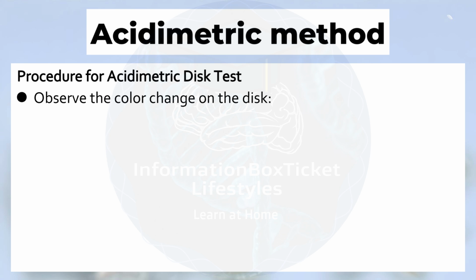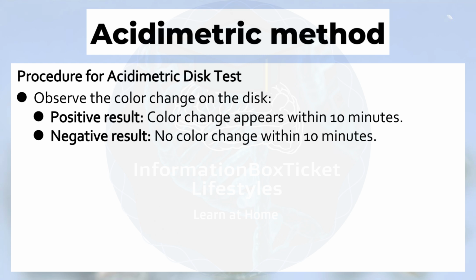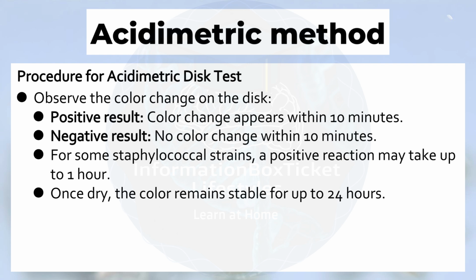Observe the color change on the disc. Positive result: color change appears within 10 minutes. Negative result: no color change within 10 minutes. For some staphylococcal strains, a positive reaction may take up to 1 hour. Once dry, the color remains stable for up to 24 hours.